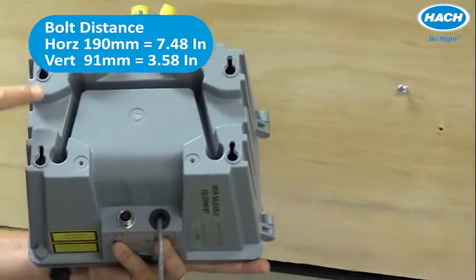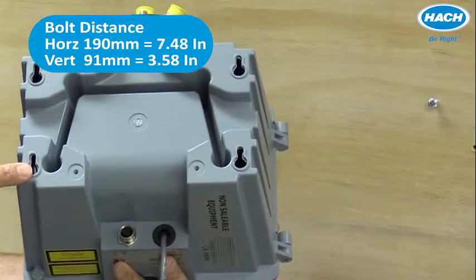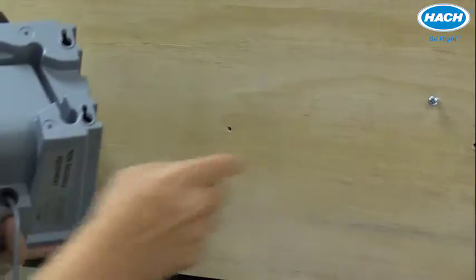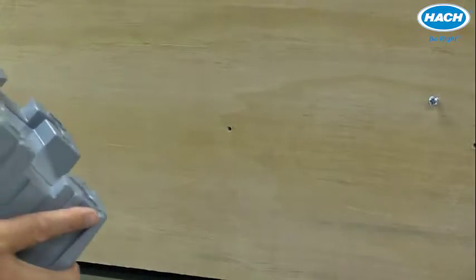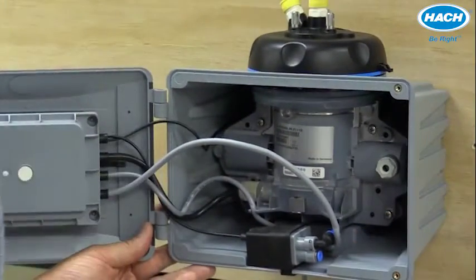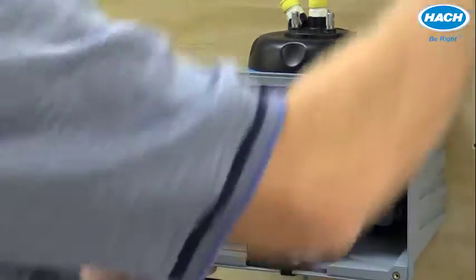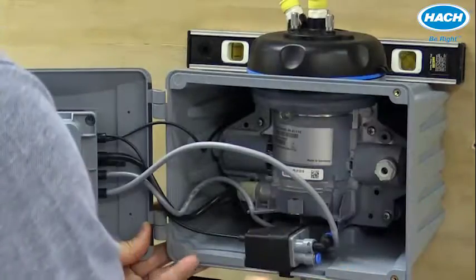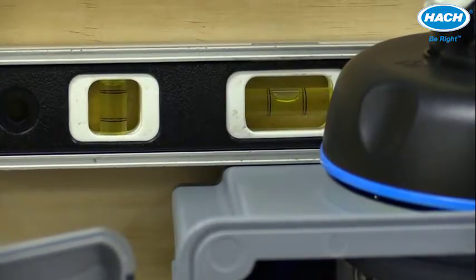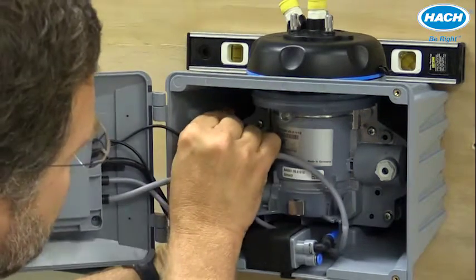Vertically, the two should be apart by 3.58 inches or 91 millimeters. A simple way of doing this is by first mounting your first bolt and temporarily placing the instrument onto that particular bolt. Using a level, the instrument can be held in place and a pin can mark the position of the other four holes.